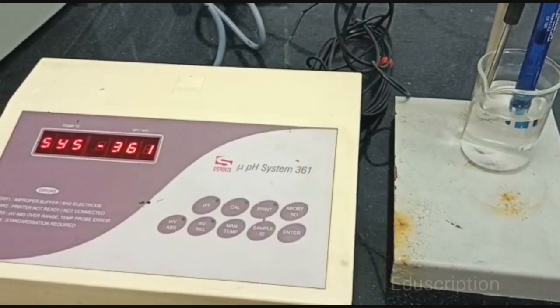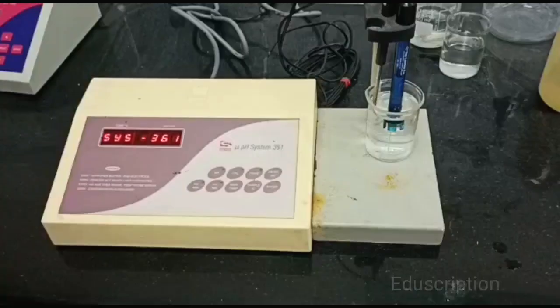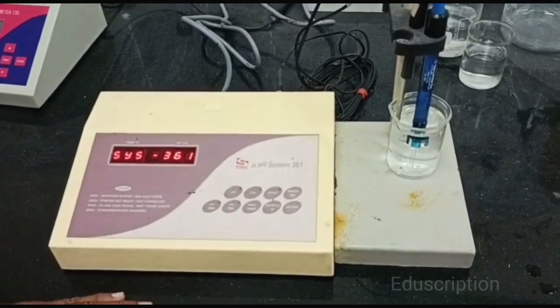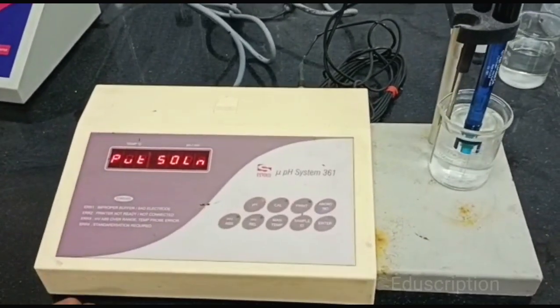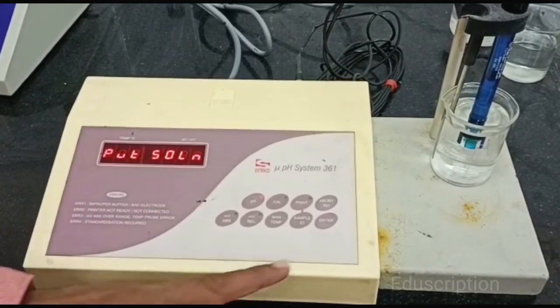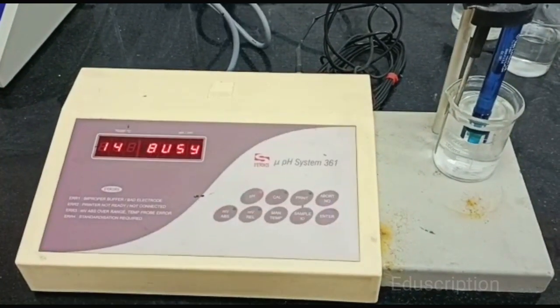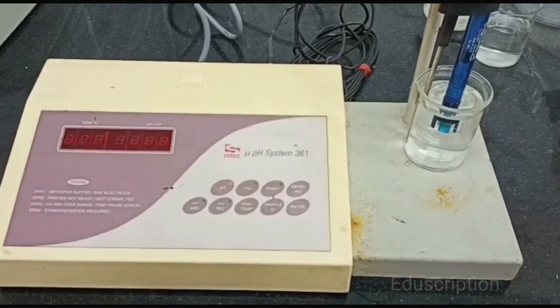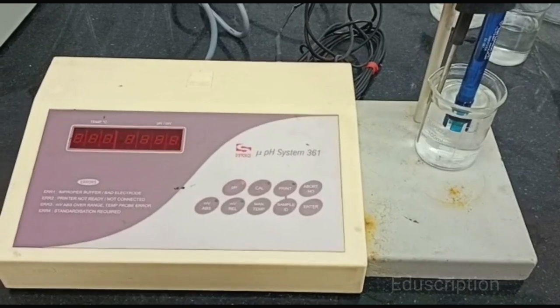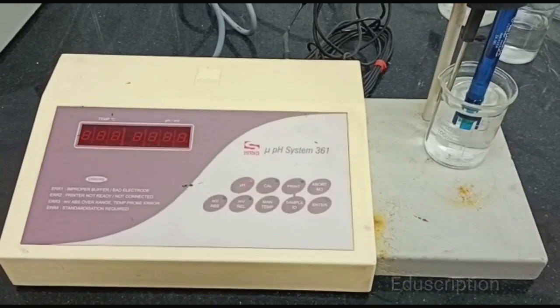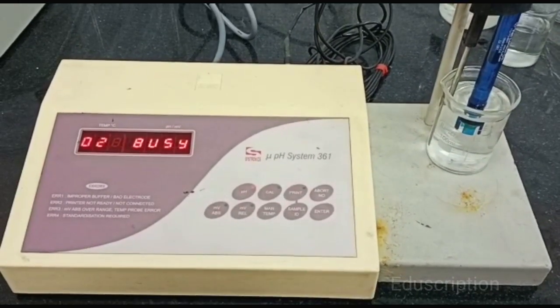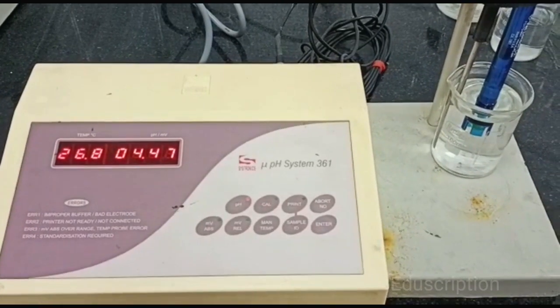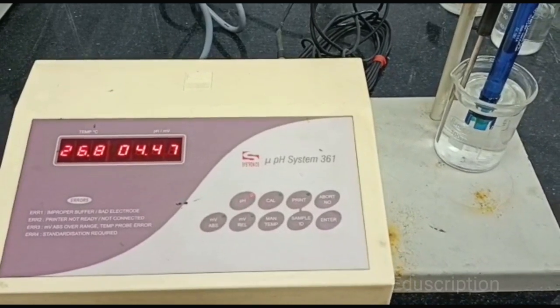Now we will go for second beaker. This is second beaker and we detect the pH value of that beaker. So press pH key, then enter. After 15 seconds it will show the temperature and pH value of that beaker.